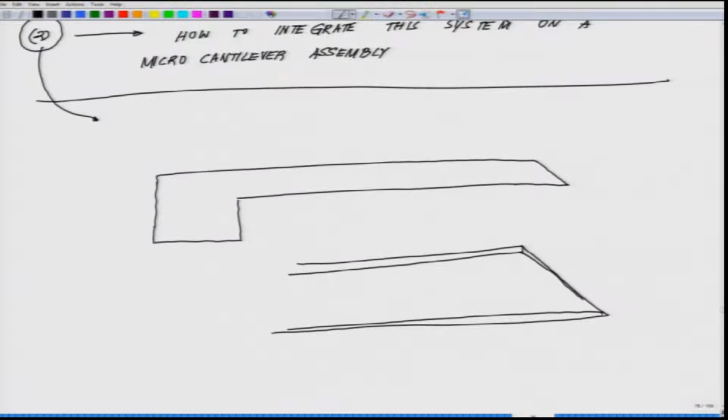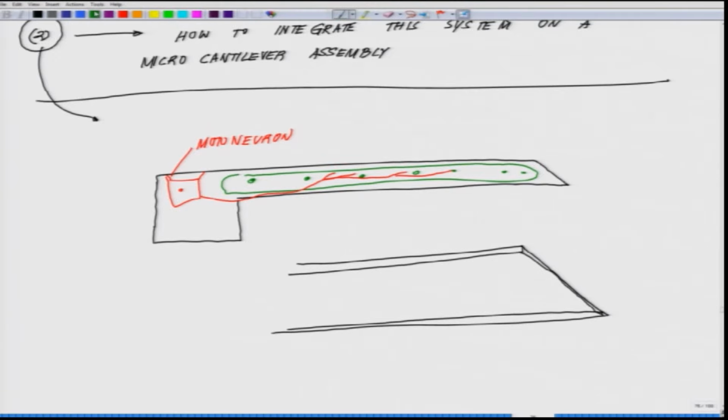Now the idea is you have a myotube growing out here, a multinucleated tube, and some way or other you integrate it with a neuron which will be forming synapses on it, which will of course be a motor neuron. And here you have a myotube.